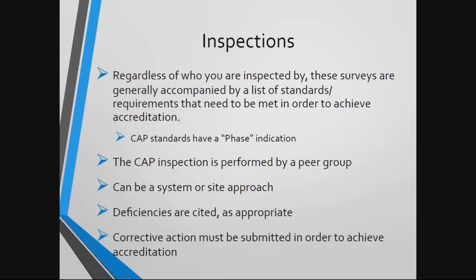The facility I work with started out as having site inspections, and then we moved to the system method about 10 years ago. So our inspections currently last probably about 4 to 5 days, with our 11 facilities being inspected over the course of that time period.